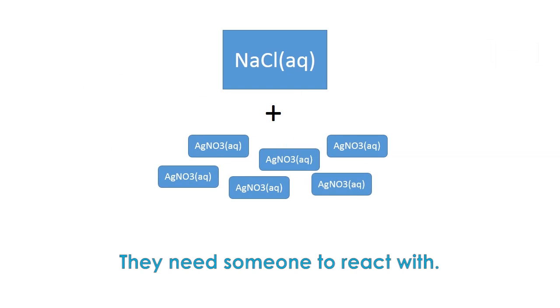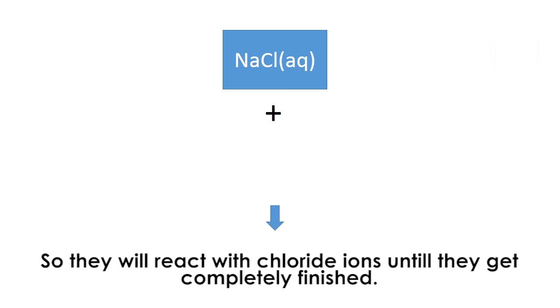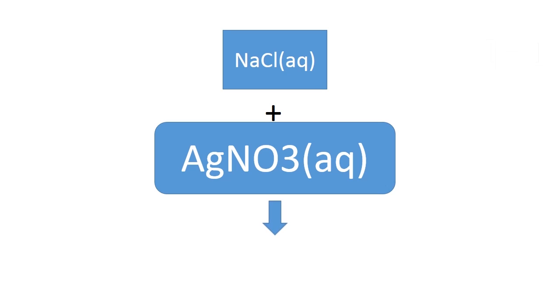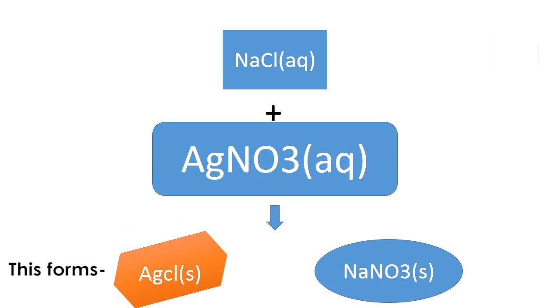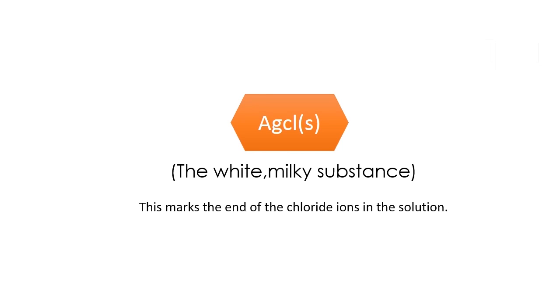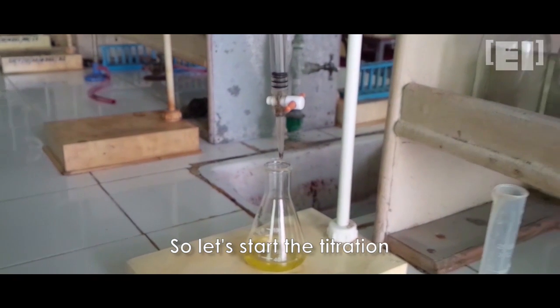The AgNO3 molecules will react with the NaCl molecules and would make AgCl and NaNO3. This AgCl has something special, it is the milky substance that keeps forming until the whole chloride ions are eaten up. So let's see this happen.